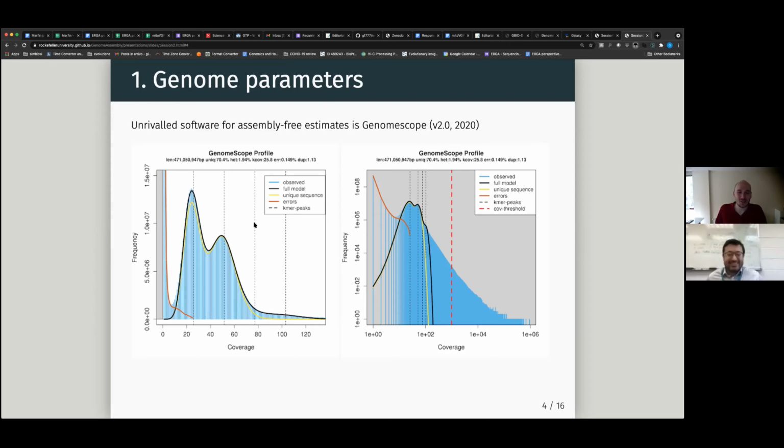All right. So what do we have here? Genome Scope takes this profile. The profile means that when you do this operation, depending on the size of the genome, on the heterozygosity of the genome, on many characteristics, you obtain a spectrum like this kind of profile that is unique to that particular genome and reflects the characteristics of that genome.